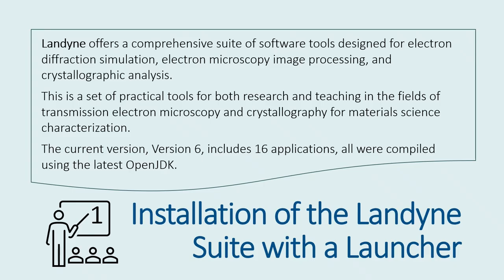This is a set of practical tools for both research and teaching in the field of transmission electron microscopy and crystallography for materials science characterization. We have a series of videos introducing the Landyne suite. In this video, we will introduce the installation of the Landyne suite and the launcher.